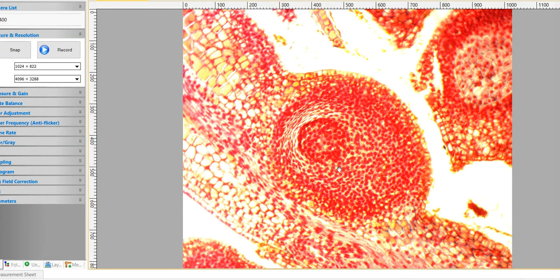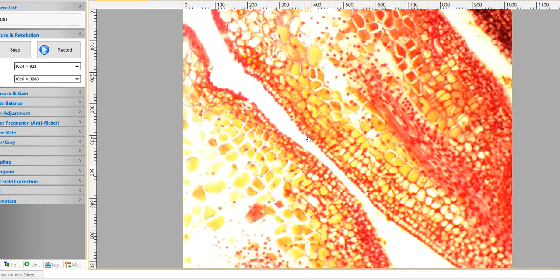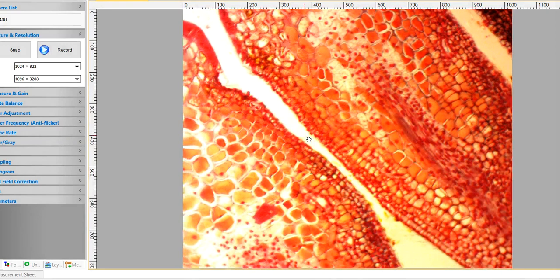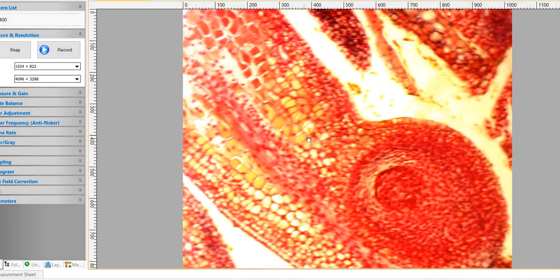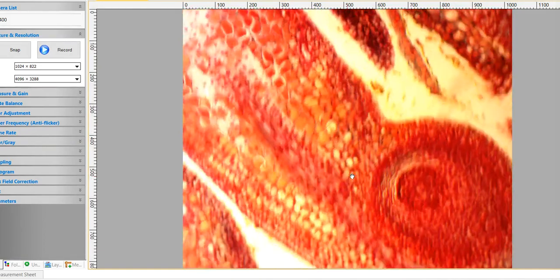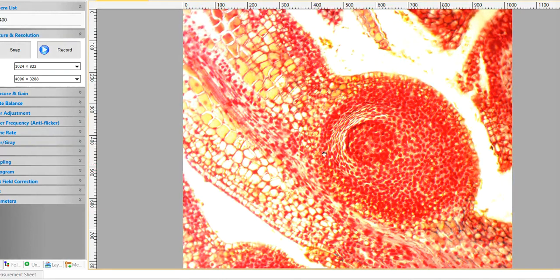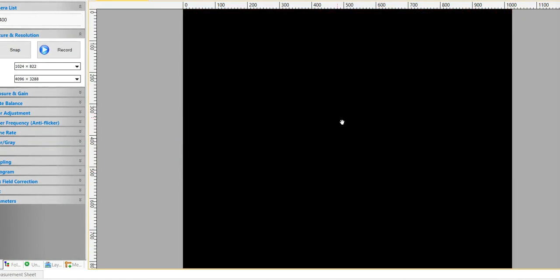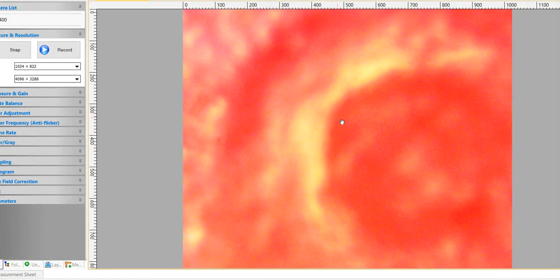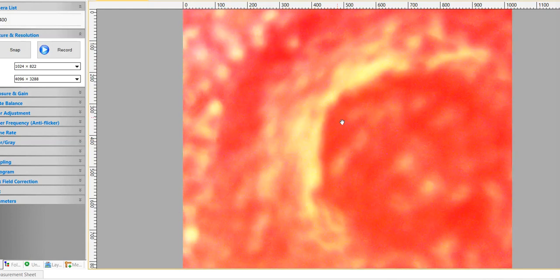Okay, so yeah, looks like we got a little bit of a seed here. That's kind of in the center. We're actually kind of centered right around here. Let's center this. That looks kind of, oops. If I lose it entirely, there we go. Okay, so I want to center on that. Wrong way. One nice thing when you use your fingers is you can kind of tell where it's going, although everything's reversed. Okay, so we're kind of centered in there. Let's go to our high power. We're a little out of focus. Nope, wrong way. We're getting a little more out of focus.